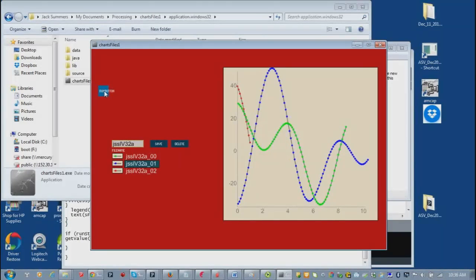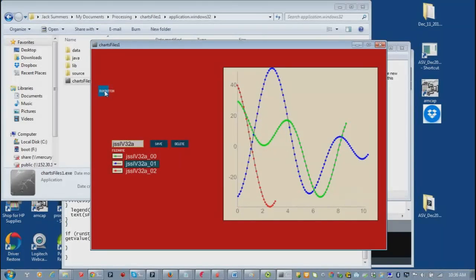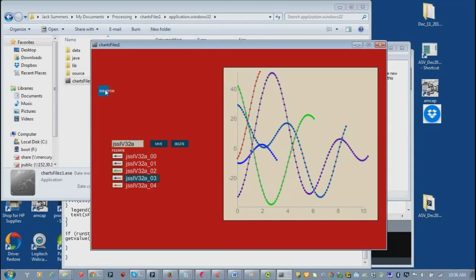If we run another one, the new file will have red dots. The second most recent file has the blue. The third most recent has the green. And if we keep on acquiring more data, we can see what the color scheme is. And you'll notice that over on the left hand side there's a legend that tells us which of these files goes with which color data points.